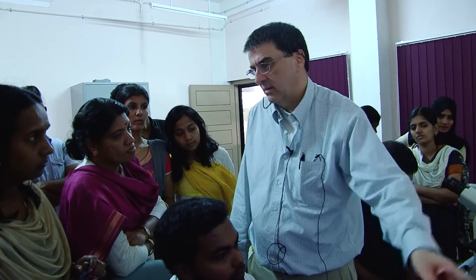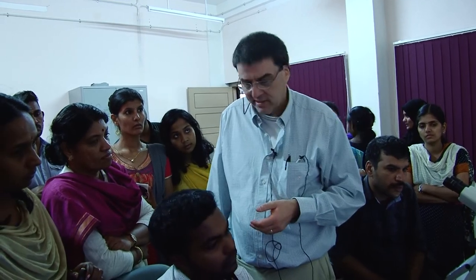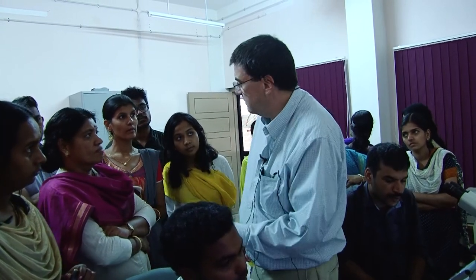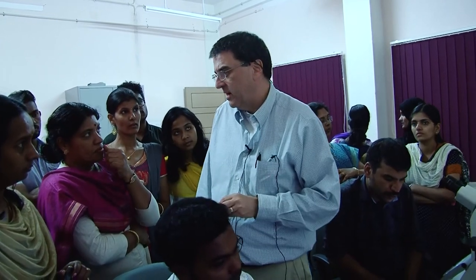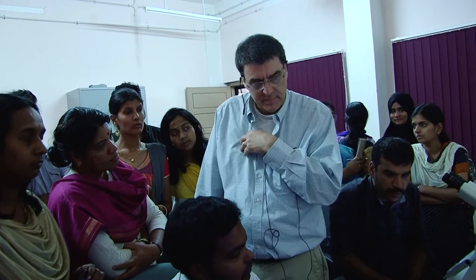Yellow. Okay. But again, excitation is limited by the laser line. For some reason, I had people yesterday ask me about, can we excite at 350? And it's like, no, you can't. And to tell you the truth, top of my head, I'm not sure what kind of scope you'd use to do that, because in biology we don't go down that far usually, because that's just damaging. You're down in the UV, you're really damaging. It's not a biology kind of thing. And the other thing is, now this is my personal experience, if you're trying to come up with two or three colors, there's nothing wrong with using the blue for DAPI, okay?